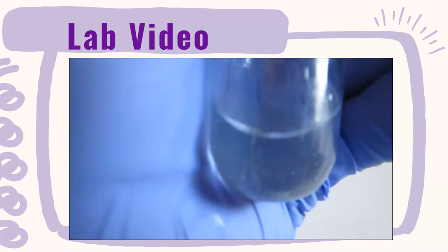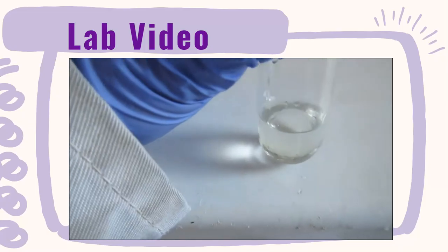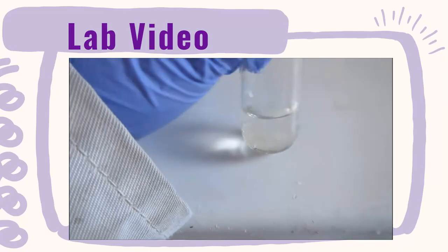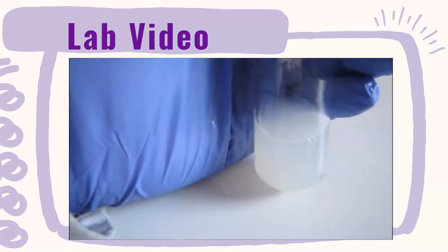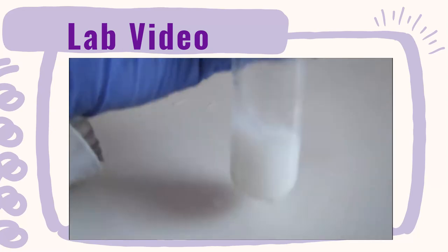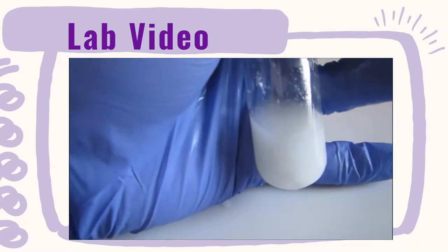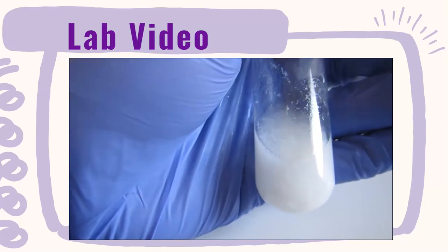That was our water. To the next one, it's our olive oil. And if I give it a shake, hopefully you can see there's little globules of fat that have formed. Might be quite hard to see in the camera. As I rock it back and forth, there's globules. So this shows that there's fat in the olive oil. Next, if I take the bread, give it a mix. There doesn't seem to be any globules in there. Then for the cheese spread, give it a mix.